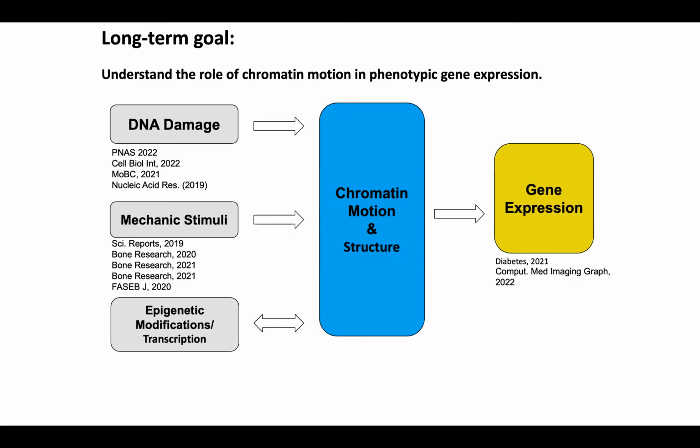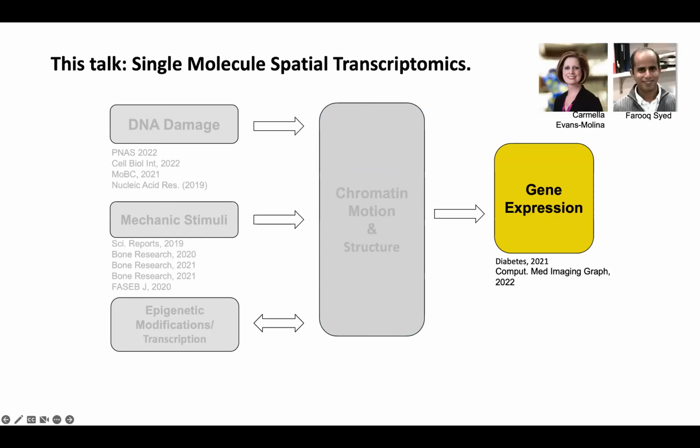On the other direction, my focus is basically on RNA imaging. Typically we started from RNA FISH images, and we also do some live cell RNA imaging to see the translational kinetics of each individual mRNA in the cell. But in this talk, I'm going to particularly focus on the interpretation of the RNA in a single cell.